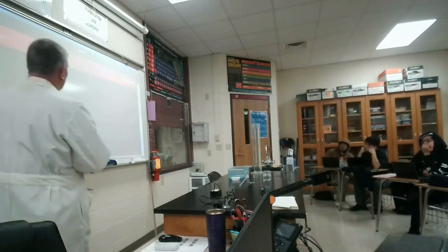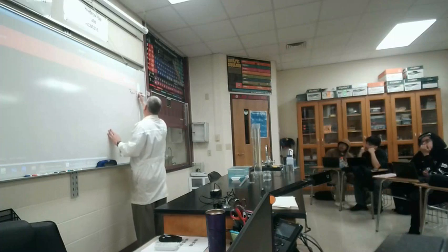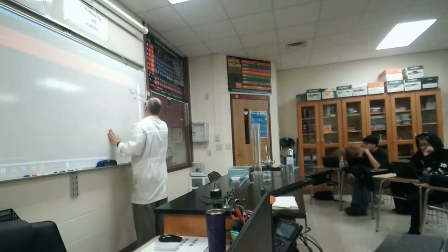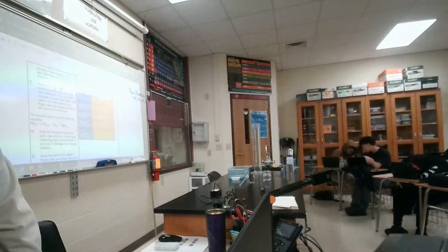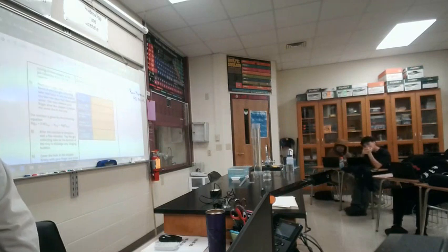So, room pressure right now that we are all going to use for this experiment is 98.84 kPa. That is what we are going to use. So in the data table near the bottom, ladies and gentlemen, room air pressure 98.84 kPa. That is what you will put in there. Questions?